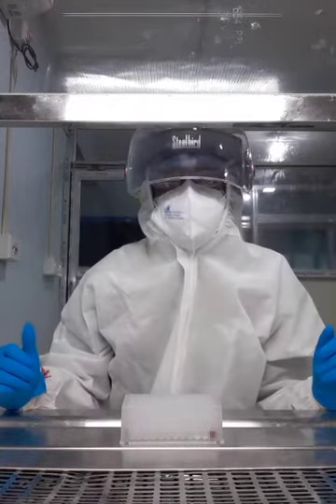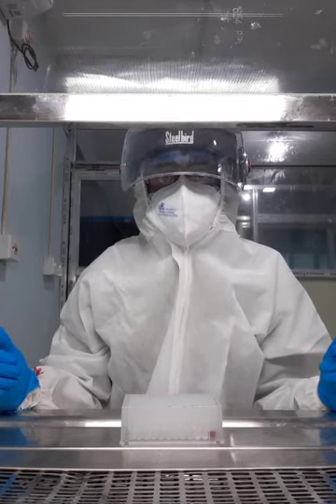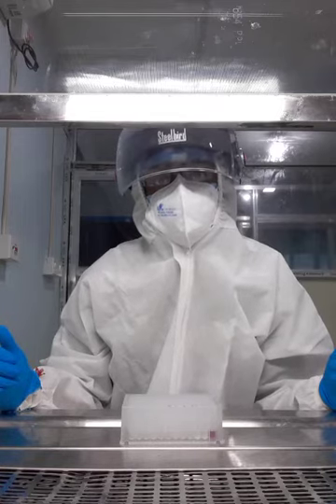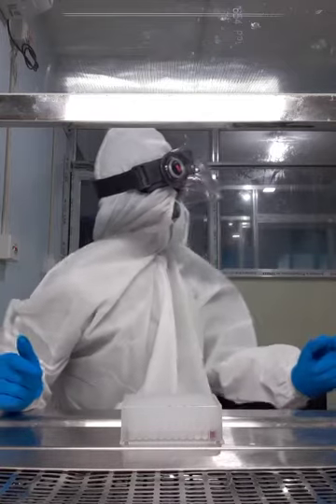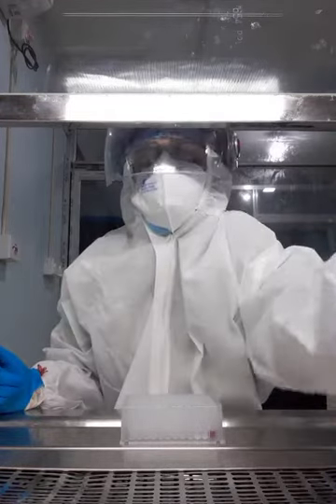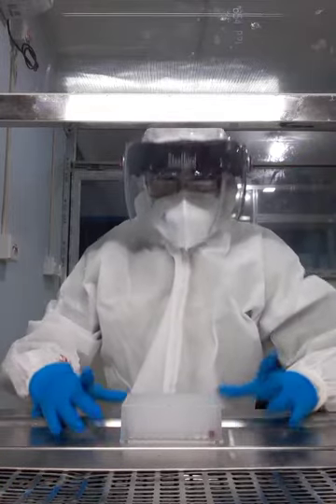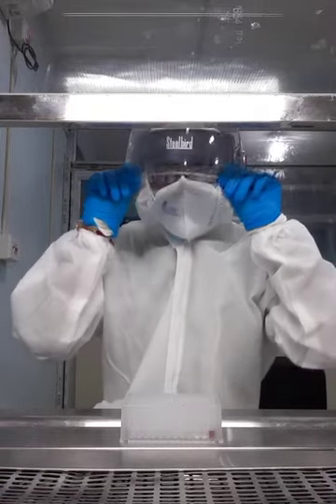So I just covered it. During the process, I cannot talk. I told you before that you have to put 100 microliter VTM sample in the first column for patient A, and another 100 microliter VTM sample for patient B in the first column. In the first column I have put the VTM sample. This is the sample of patient A, and this is the sample of patient B in the first column respectively. I'm not able to talk during this procedure, so just have a look.